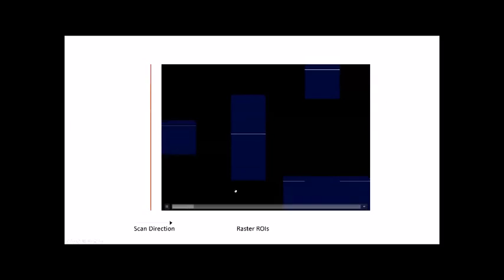But we have much more flexible control over the patterns on the DMD than just that. For example, we can scan just subregions of the field of view. That speeds up the imaging, because now instead of this line of pixels having to traverse the entire height of the DMD, in this region it's only traversing a smaller number of rows, and we get a proportional increase in speed. And we can do different things in different areas, and the speed up depends on the number of rows that we're going to image in that given column of the DMD.